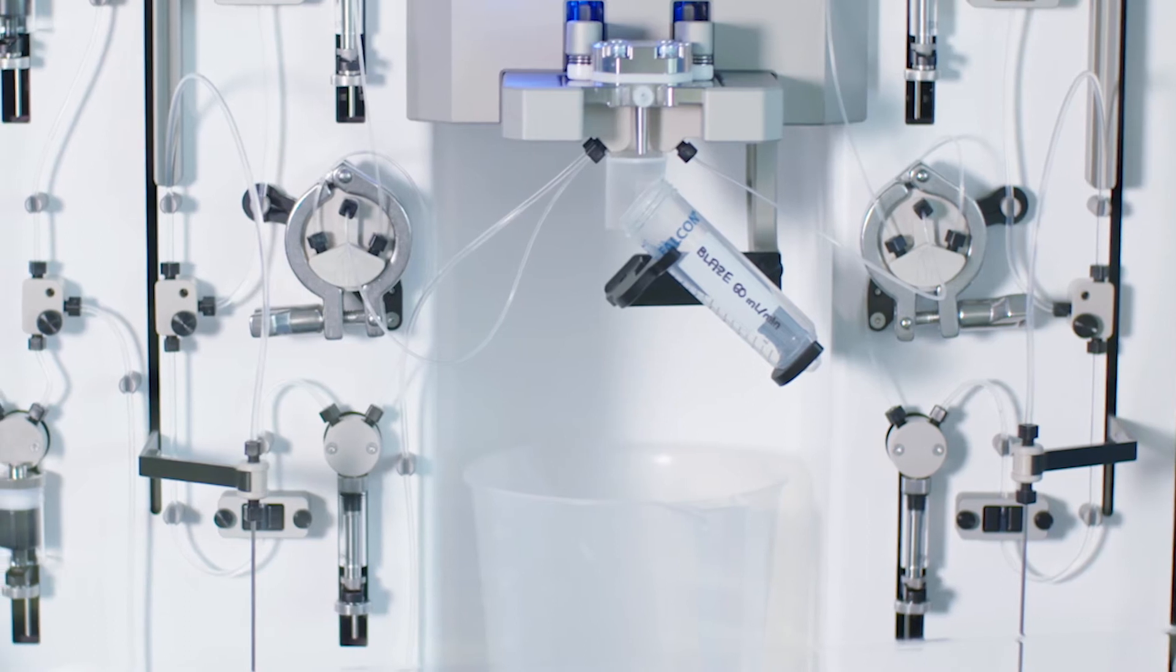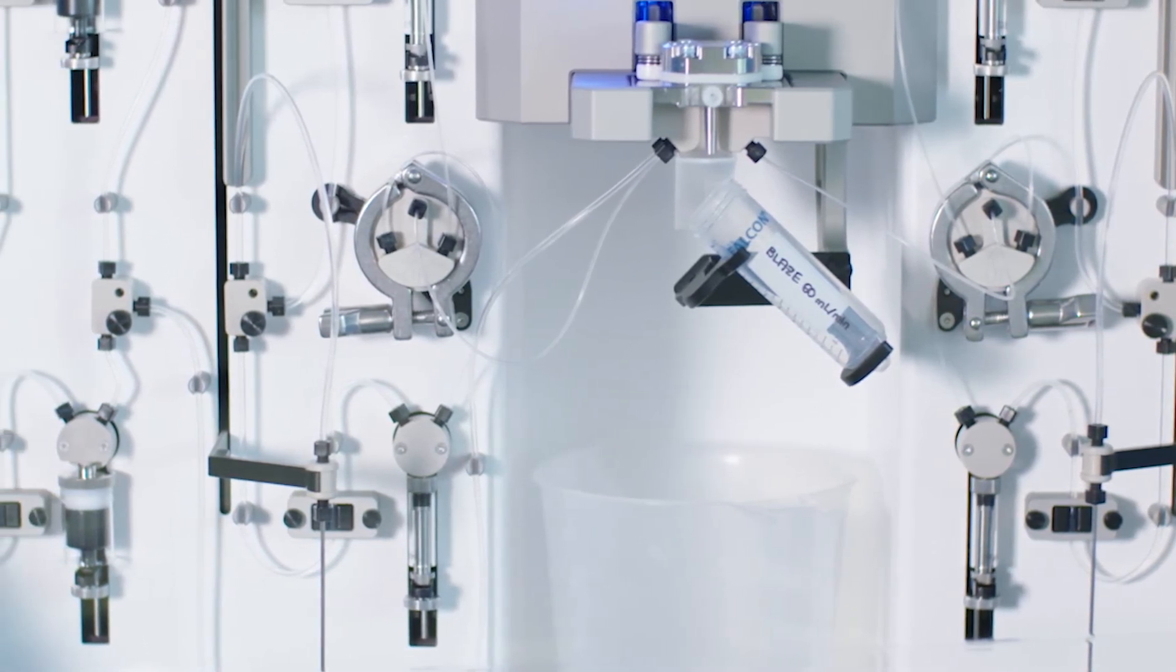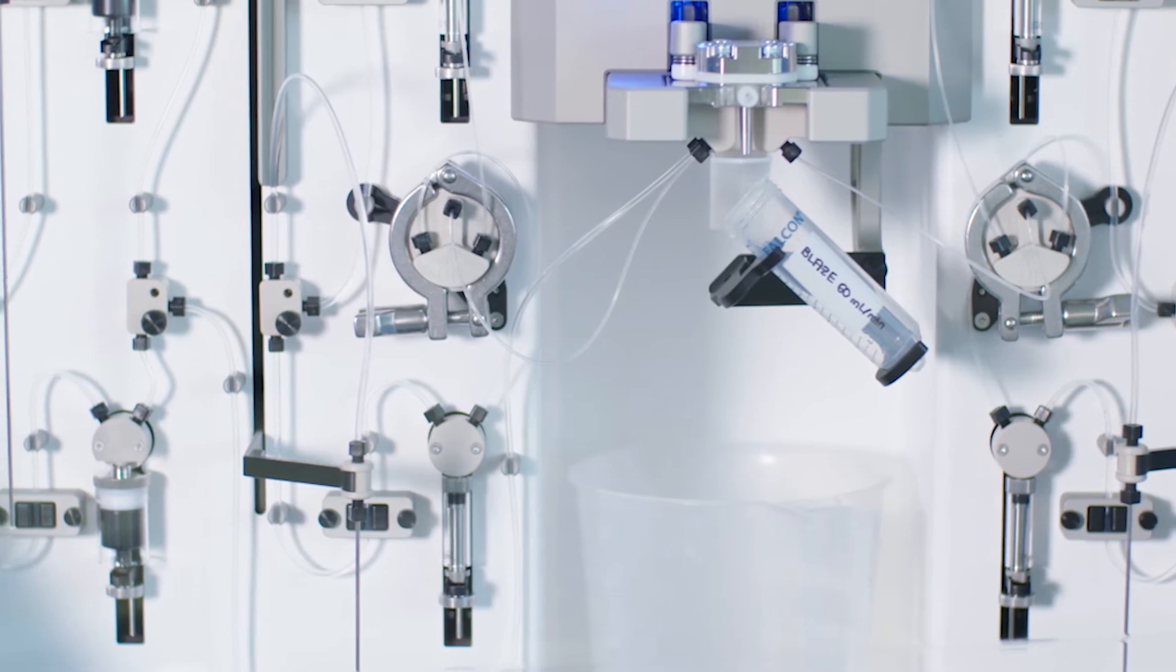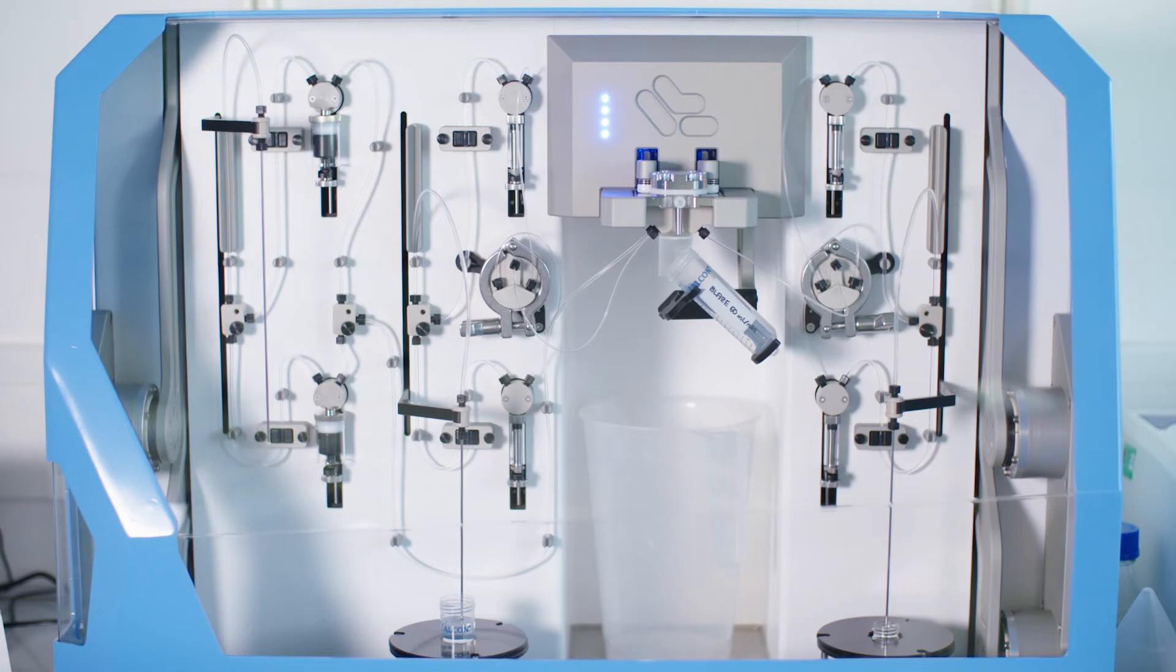You can choose between NextGen 400 or NextGen 500 mixers, the latter being identical to what's used in the GMP system, so you're able to develop your scale-up process with the same mixer you'll eventually use for clinical manufacturing.